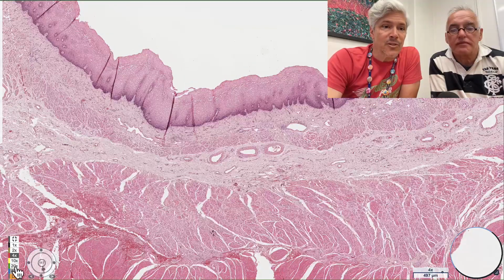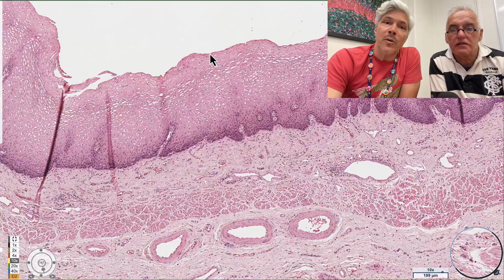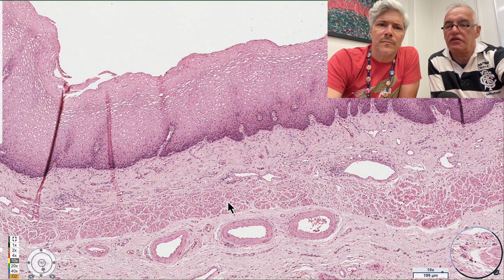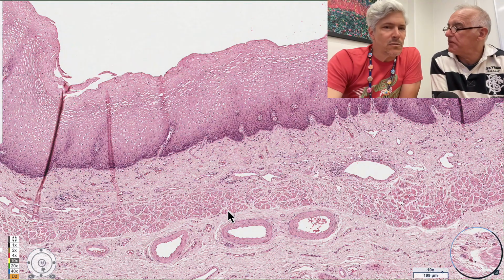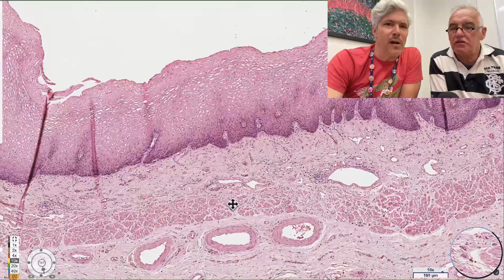Zooming in, let's go to 10x. And here's what we see. From the apical cells of the epithelium down to a little strip of muscle here called the muscularis mucosa. That defines the very bottom edge of the mucosa. Yeah, so it's not just epithelia on basement membrane. You've got this little strip of smooth muscle underneath. Right. Which serves to move things around. It's got a little bit of movement structure. You just identify that as smooth muscle from here? That's sharp eye. I'm good.